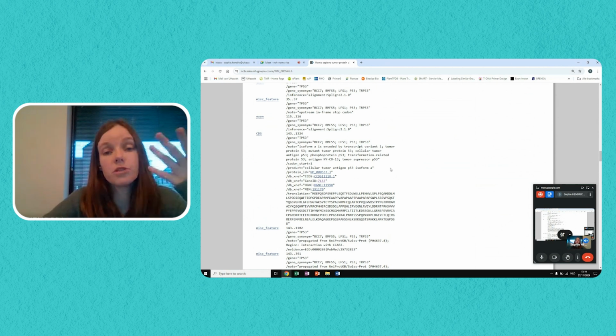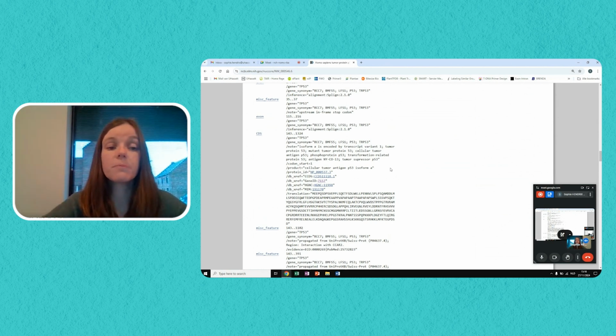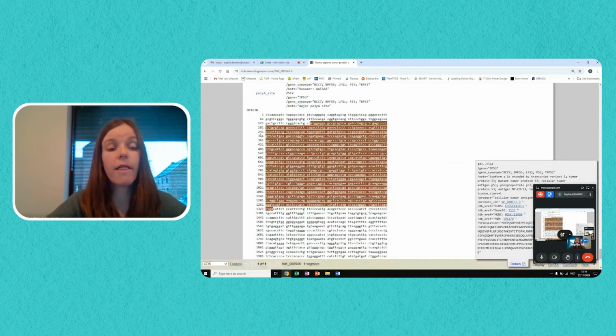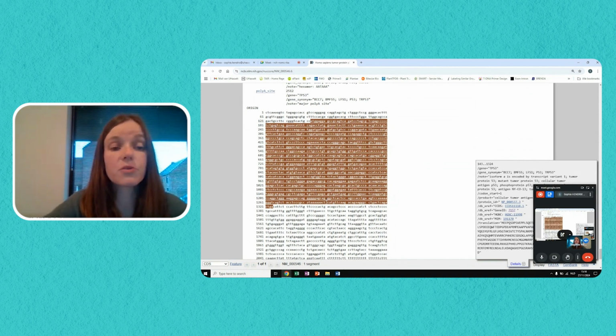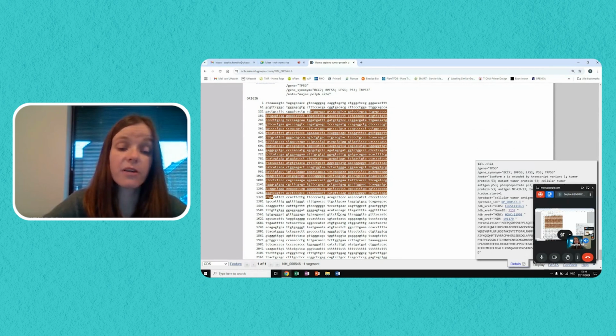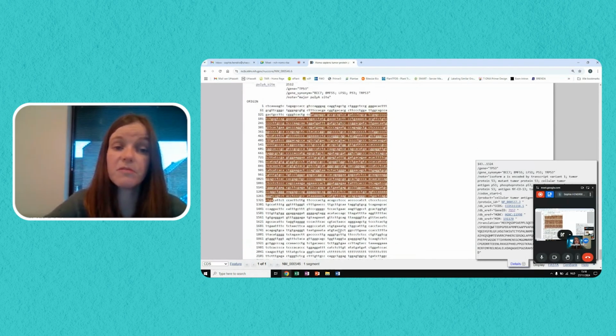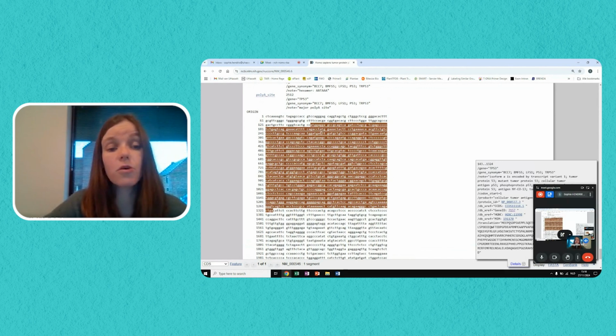We will generate primers specifically for this part of the mRNA. So we will click CDS, and then at the bottom of this page, you find the entire mRNA sequence of the first transcript variant of P53, but now the coding sequence has been highlighted in this brown color.